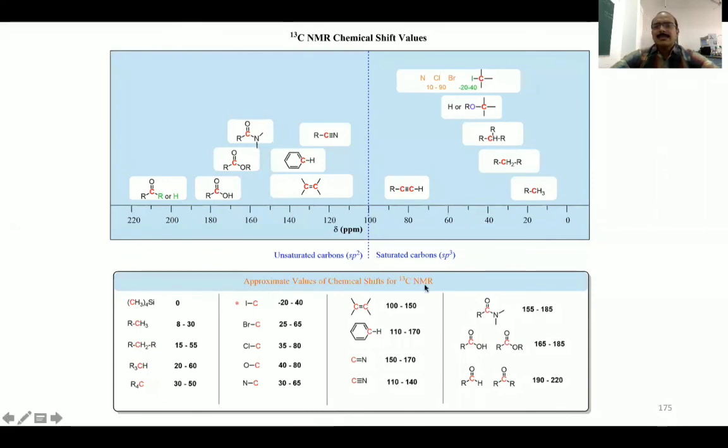Now we will see in this chart how the chemical shift value varies for different kinds of carbons based on the functional group it is attached to. So even here the solvent used here is tetramethylsilane as that of your proton NMR. So we know that in tetramethylsilane, all the methyl groups, there are 4 methyl groups, are present in the identical atmosphere. As a result of that, it will give 0 delta. Even in proton NMR, it will give 0. Even in carbon, it is giving 0.